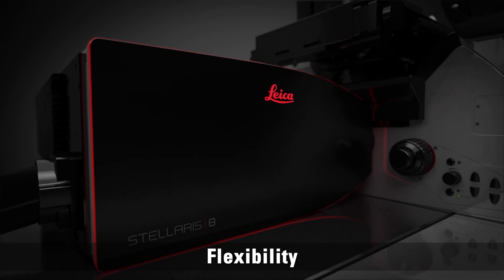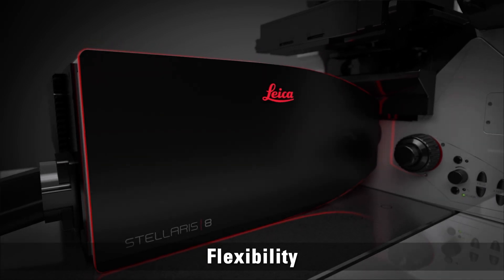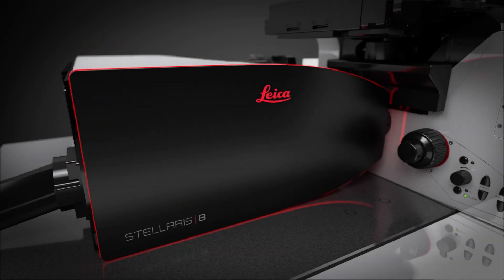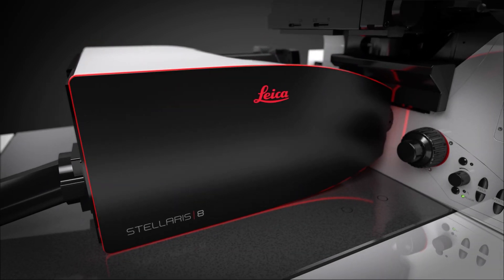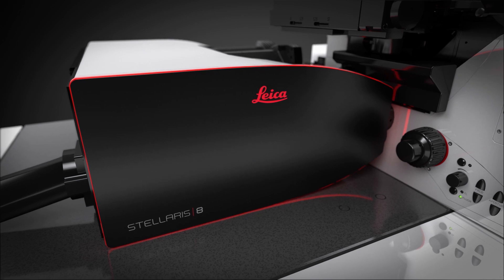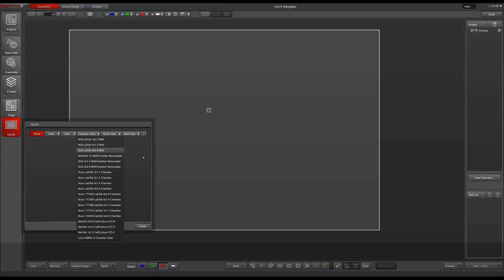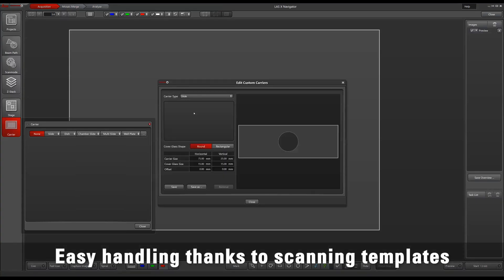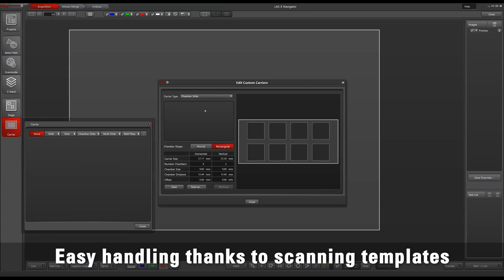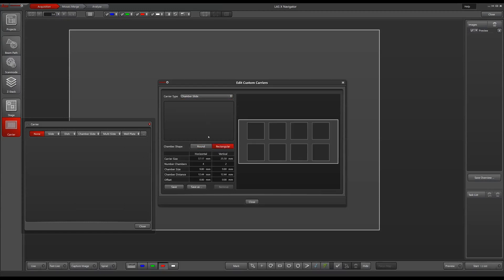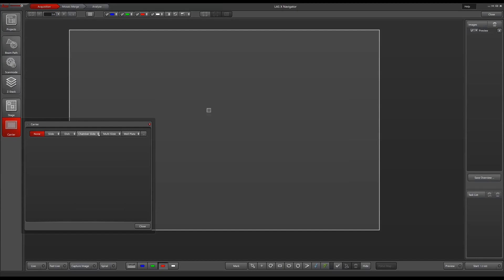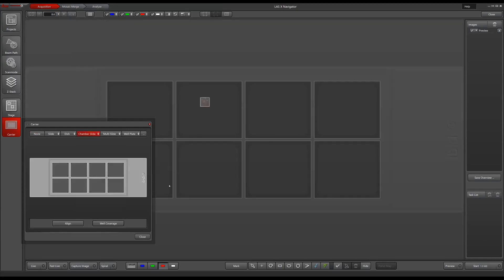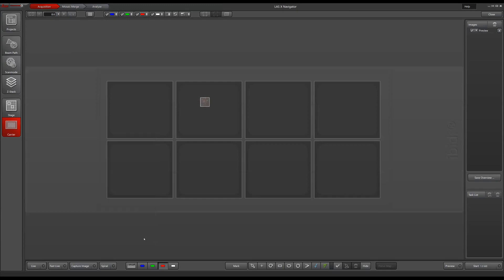The navigator comes with several additional functions for your Stellaris. Save time doing reoccurring high resolution imaging tasks by using scanning templates. Define your own templates or use the default templates of the LASX Assay Editor for common slides or multi-well plates.